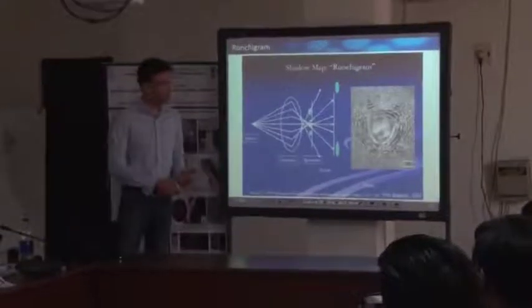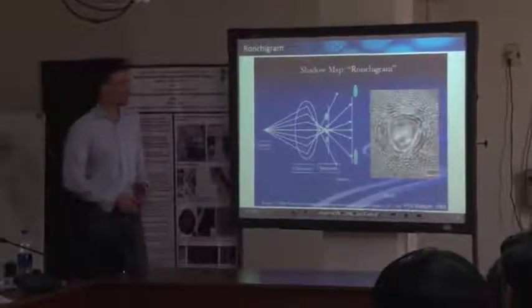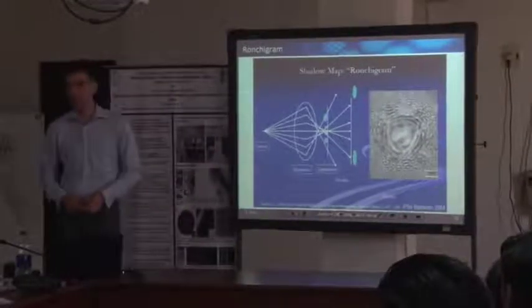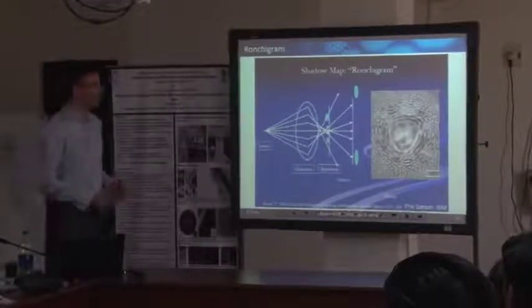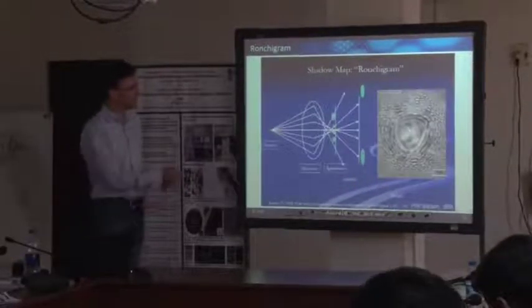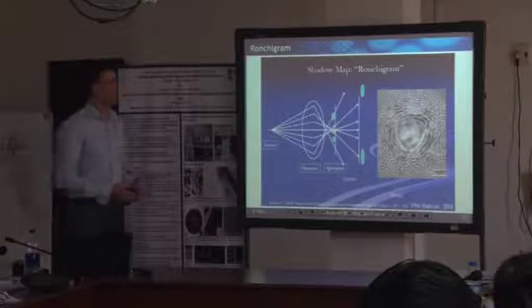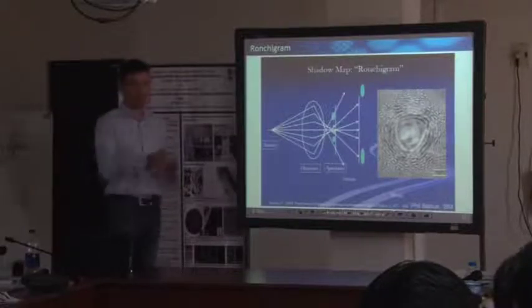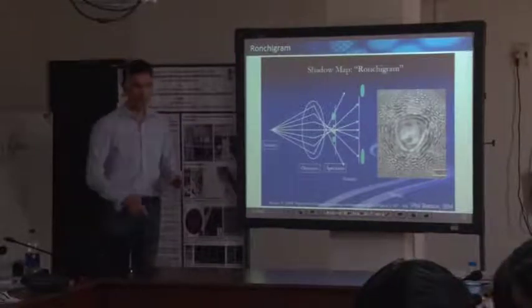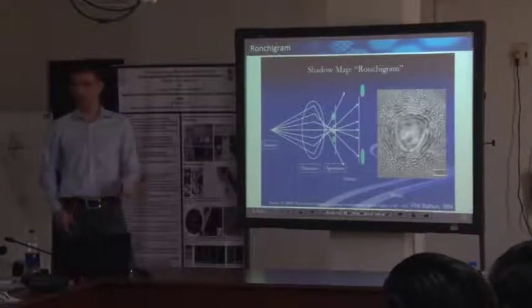And what we have to do now is to just cut all of this, the tail of the electron probe, just by using a small aperture that just covers this inner region. This is what you do. So first of all, you align your microscope under those conditions, with a slightly defocused probe, you can get closer and closer. You align your astigmatism and all that, and your rotation center, meaning making your beam parallel to the optical axis. And finally, you just focus, you cut off the tail, and then you are already focused on the sample, and immediately record that image.